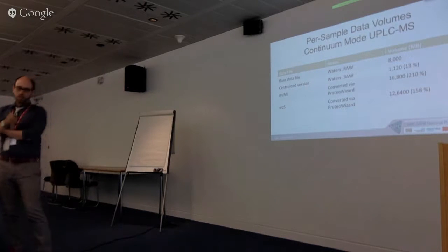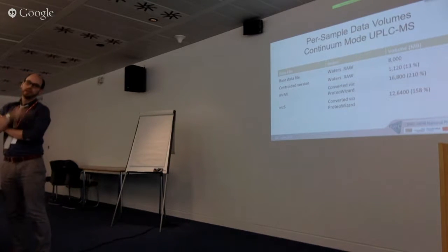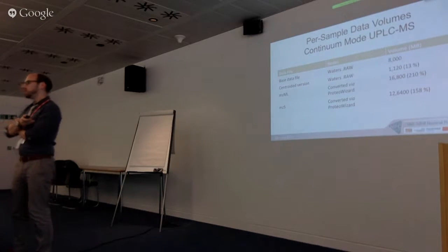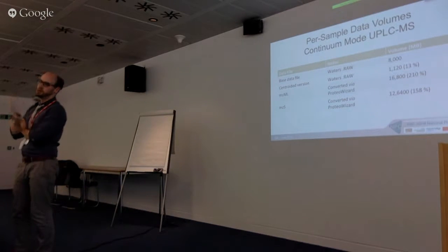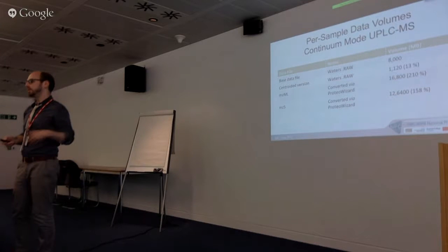So we run our samples, we run a very strict 15-minute cycle for our acquisitions, and this is to keep one day's acquisitions to 96 samples fixed on a 96 well plate. It means we can keep a very rigorous schedule: put the samples on at X o'clock one day, it'll be done in time for the next day. We don't end up with this sample creep where some of them come in at 2 in the morning and you have to change the plate.